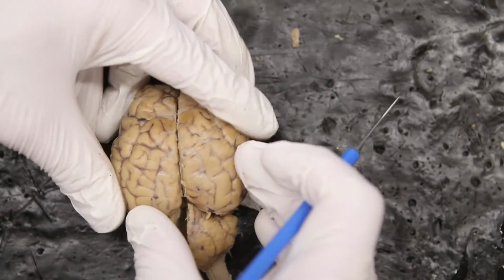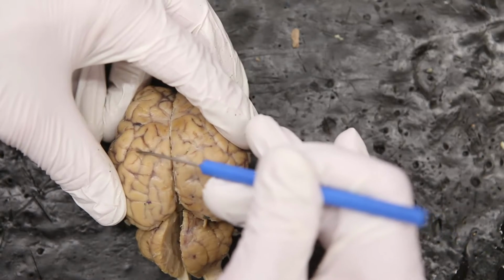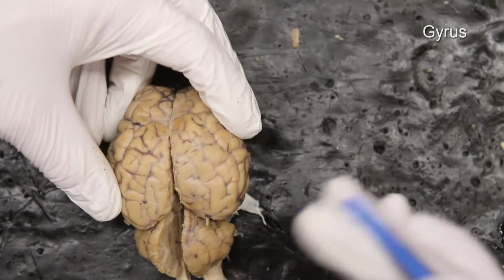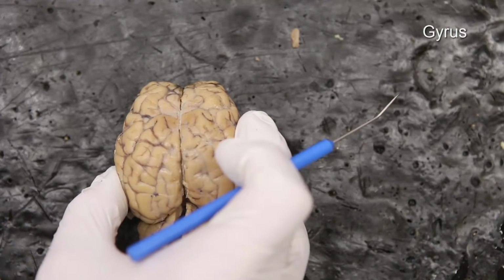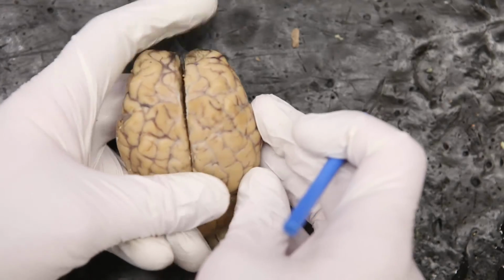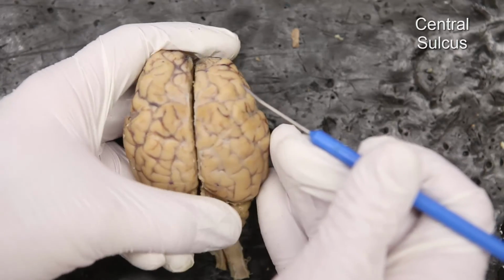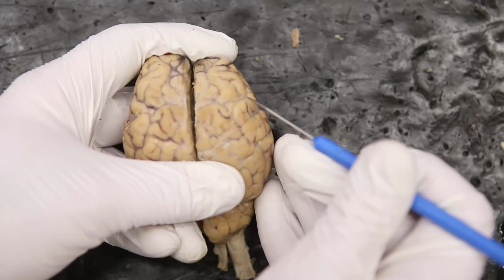A couple other things to note. When you look at the brain, the indents here are generally known as a sulcus, while the upfolds are generally known as a gyrus. And there is one sulcus of note. We're going to have our central sulcus. So we're looking for the central sulcus. It's the one that goes all the way across. The central sulcus is separating the frontal and parietal lobes.